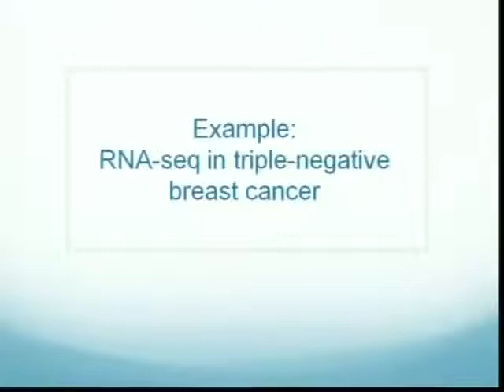All right, so what I'm going to do now is show two shortened vignettes of some research that my group has done in RNA-seq in triple-negative breast cancer and also in thymic cancers. It's going to sound slightly like a research seminar, but I've put some teaching points through it. It's being used to show an example of how RNA-seq is done in these tumor tissues, what you can get from it, our personal successes, and a little bit of how I learned some things the hard way.